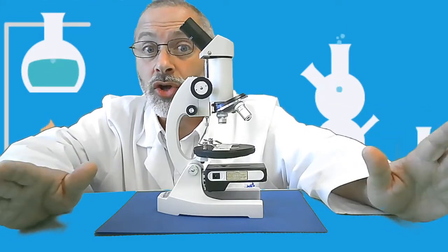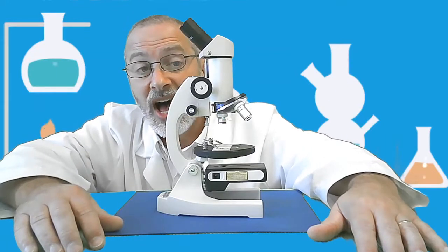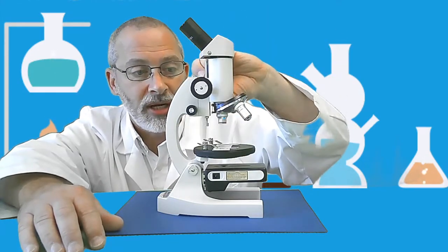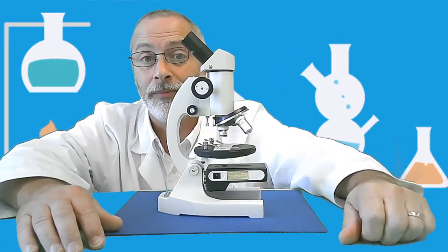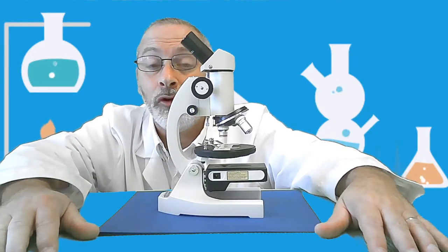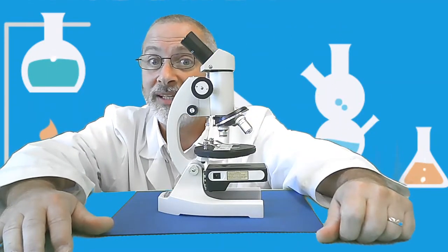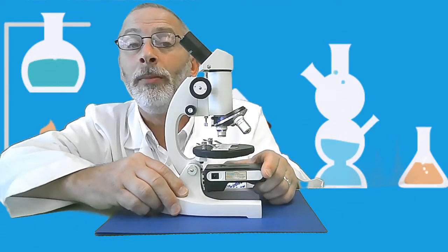So far, so good. Next step, while you're looking at it from the side, making sure you have it on the low objective power lens, use the coarse adjustment knob to lower the body tube all the way down. There's plenty of room. You're not going to smash the glass slide if you've done it correctly and you have the low power objective lens pointing down. Next, you're going to turn the lamp on and illuminate your specimen.